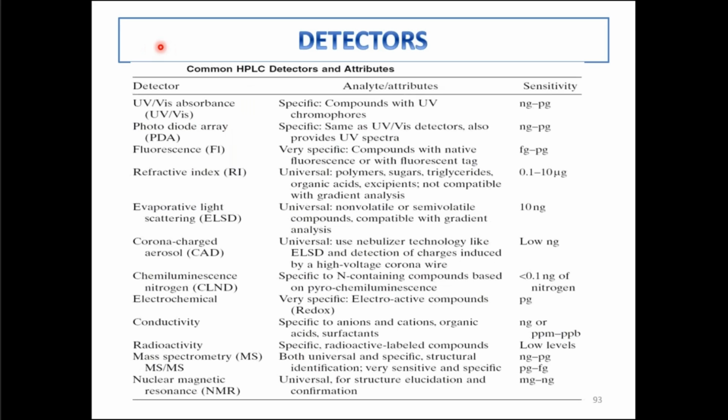Now we come to another very important part of HPLC, that is detectors. So you can see a number of detectors listed here. We will not be dealing with all of them in detail. I've just put for your reference what are the possible detectors in HPLC instruments.